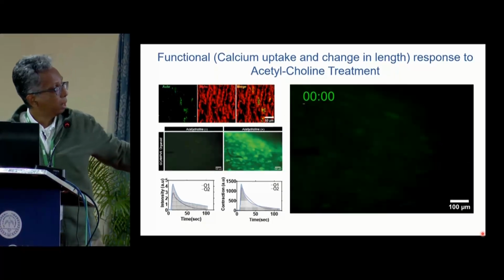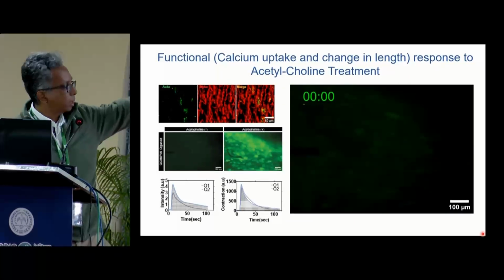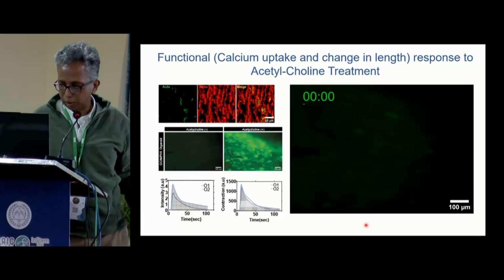So now that we can see that these fibers are aligned, and you have ACHR units there, the next thing we want to know is whether it can respond to acetylcholine.